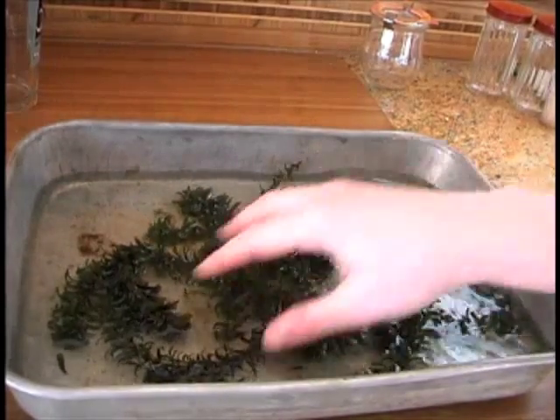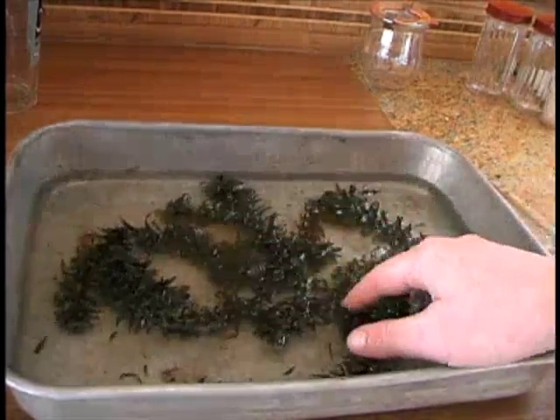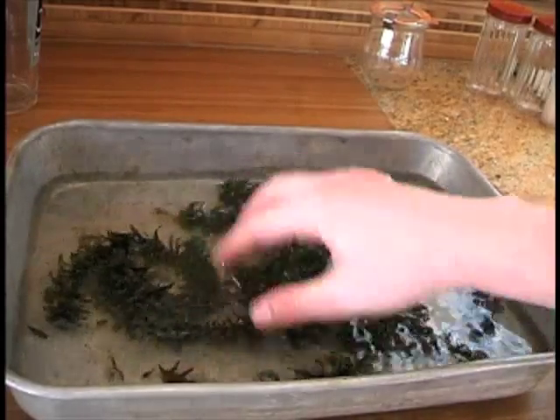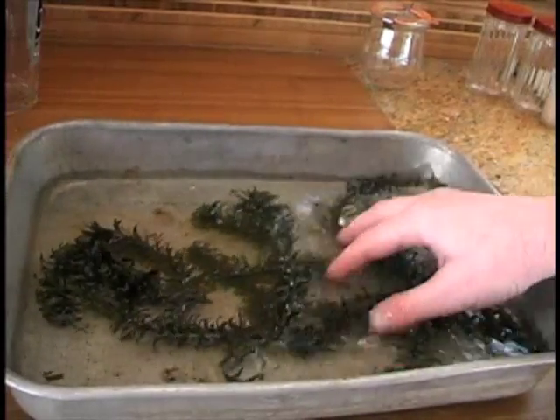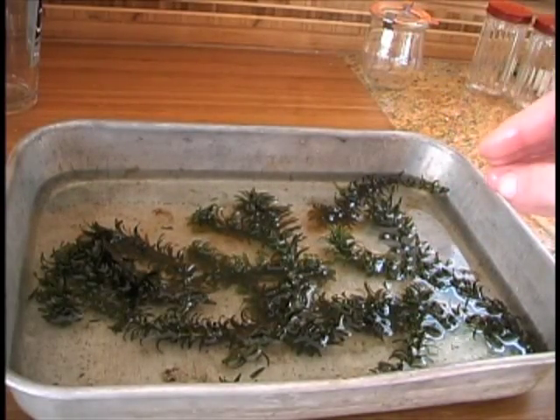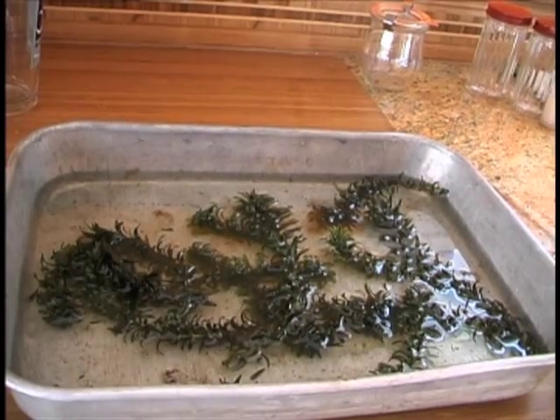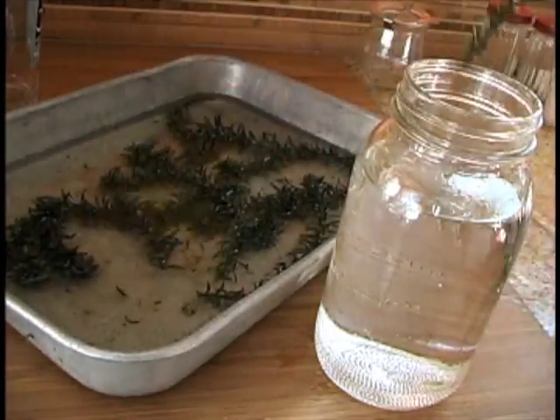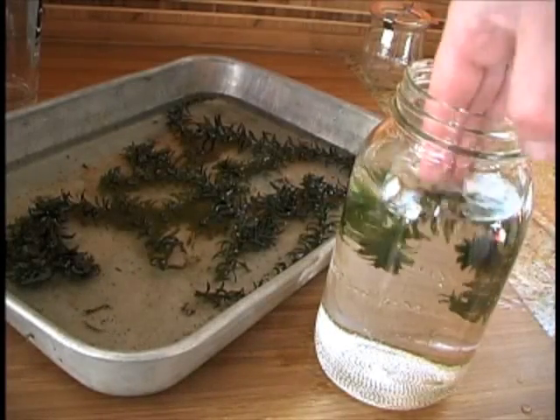When you first get your plant in the mail, simply put it in a baking pan of aged water, or some other tray you have, and just rinse it off a little bit. There will be dirt on it, and that dirt prevents light from getting to the leaves. We want lots of light to be able to get to the leaves so they can photosynthesize. When you're done rinsing off your Elodea, simply place it in a jar or a clear bowl.